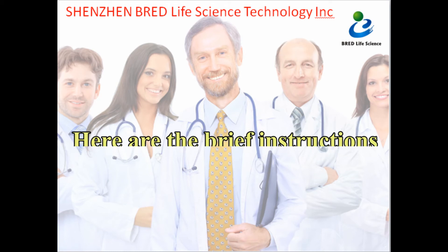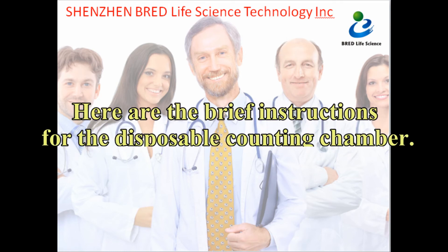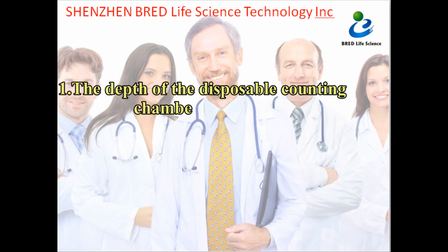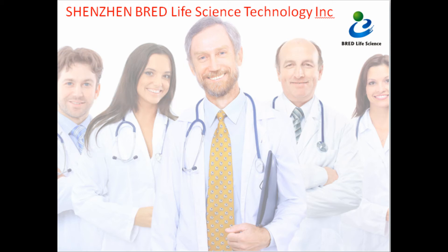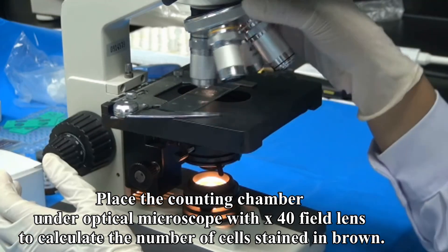Here are brief introductions for the disposable counting chamber: (1) The depth of the disposable counting chamber is 100 micrometers. (2) It is easy to operate and the specification is 50 tests per box. Place the counting chamber on the optical microscope with a 40x field lens to calculate the number of cells stained in brown.